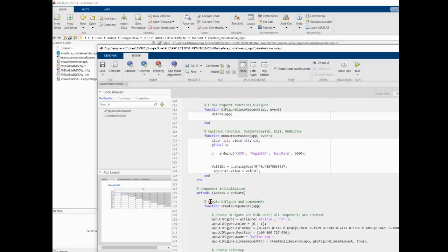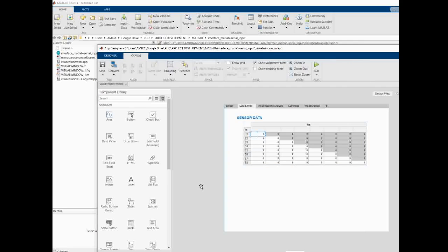So this is what I'm trying to do. I haven't accomplished this part yet. I haven't got the result yet. So I'm just explaining what I'm doing right now. This is the current activity.